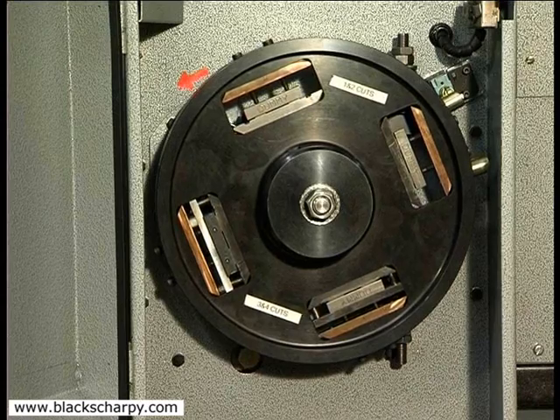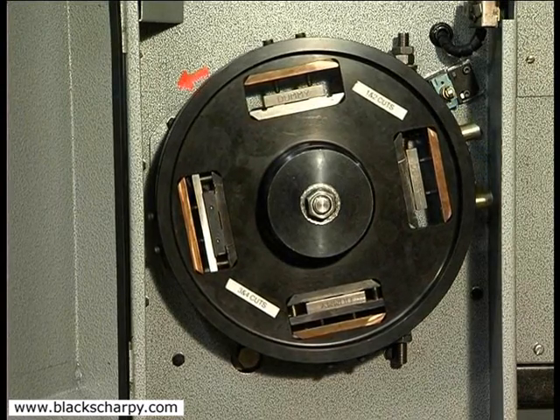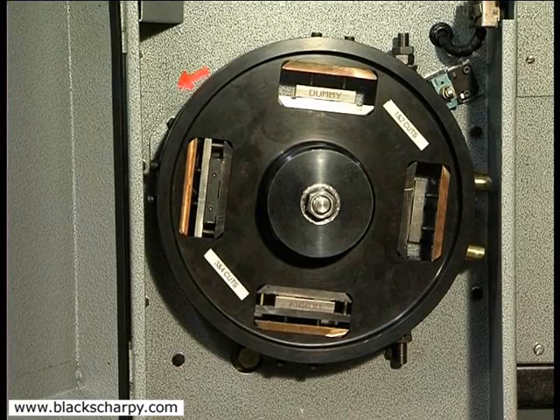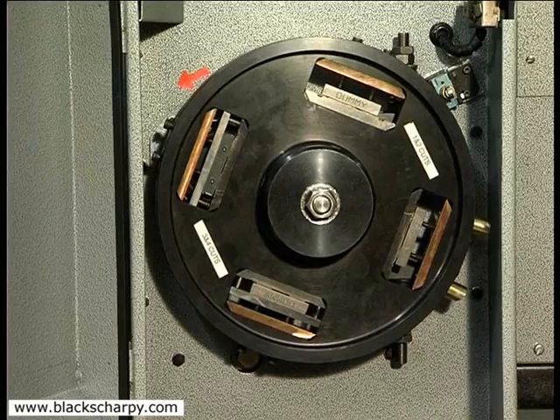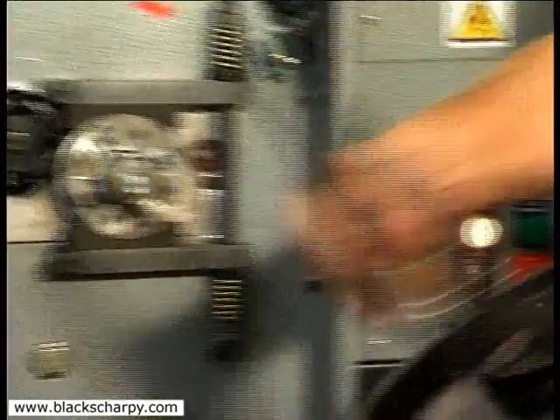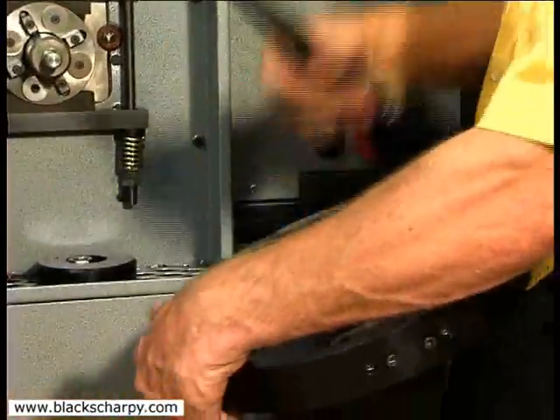The fixture is again secured on the fixture spindle, remembering to keep the locating face clear of debris. The cycle button is pressed to machine the third cut. When complete, the fixture is removed, cleaned and rotated 180 degrees, and reclamped on the spindle to machine the fourth cut. The 10mm square sample is now complete.